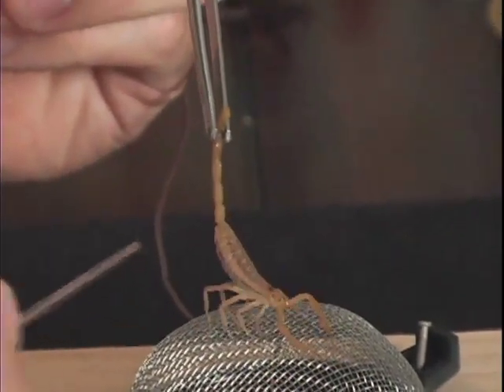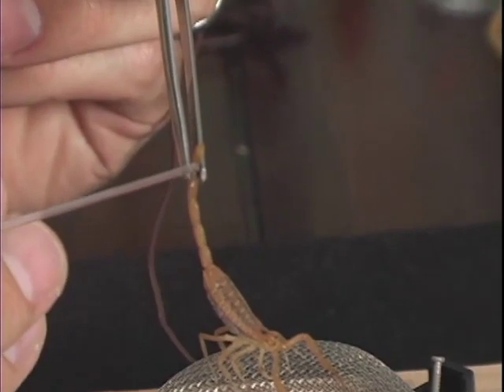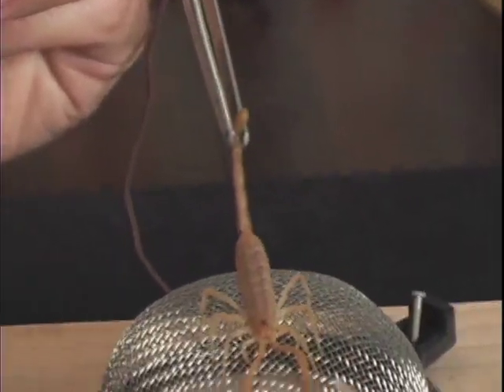As the scorpion is stimulated, you can see the tail pulsate and a tiny drop of venom expressed from the telson. I have a capillary tube in my other hand so I can collect the venom as it's being expressed.